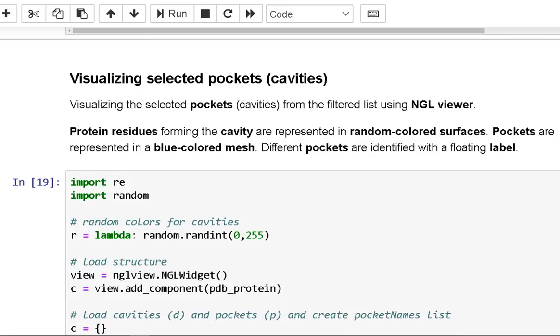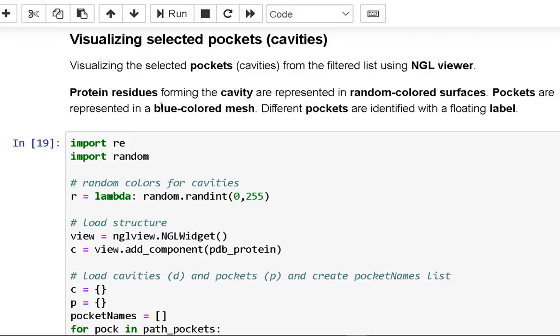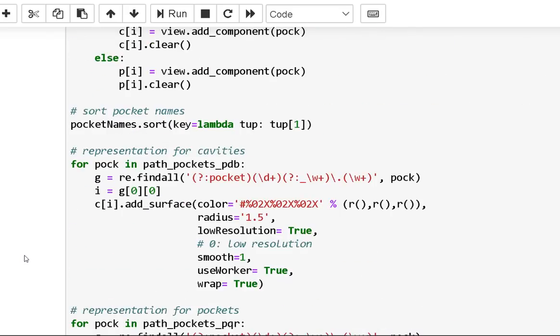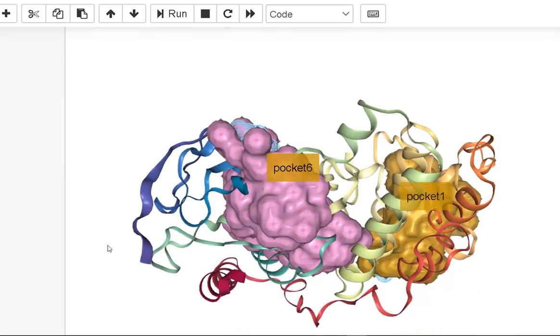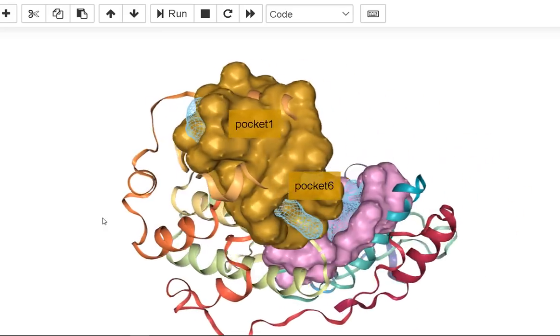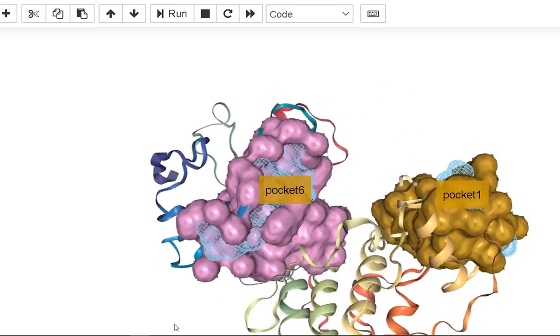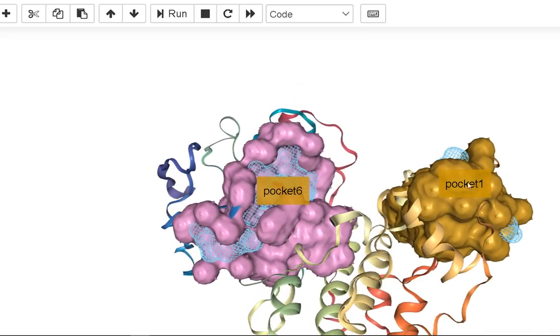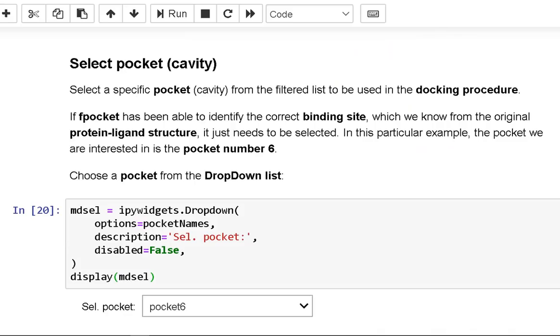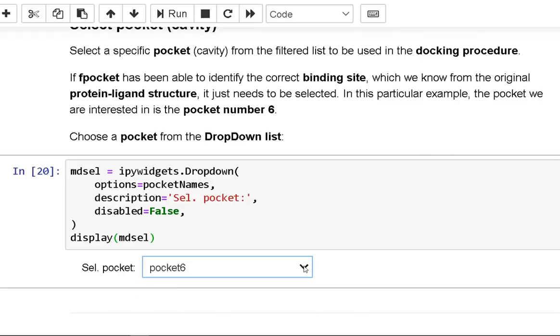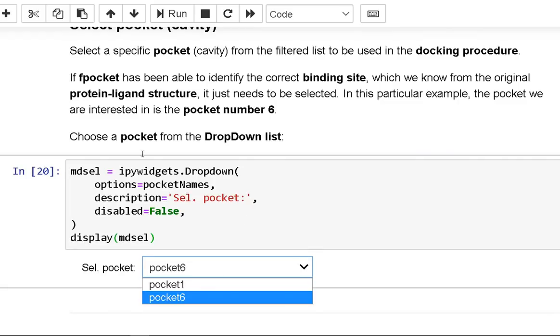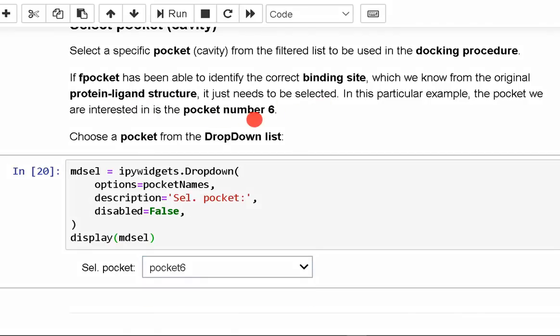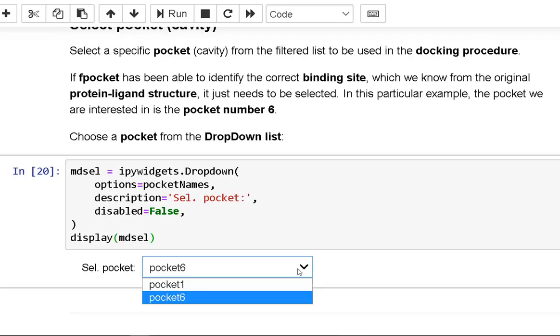For visualizing selected pockets, we use the NGL viewer to visualize the selected pockets from the filtered list. Randomly colored surfaces represent the protein residues that make up the cavity. A blue colored mesh represents the pockets, and a floating label distinguishes the several pockets. To employ in the docking method, we select a specific pocket from the filtered list. If FPocket has found the proper binding site, which we know from the initial protein-ligand structure, all that is left is to pick it.